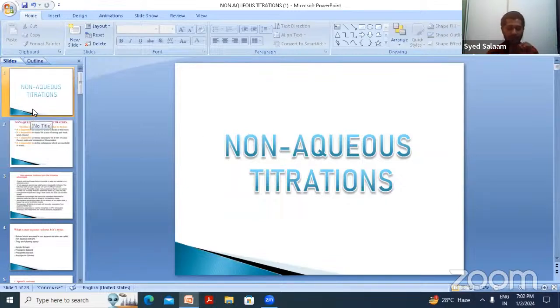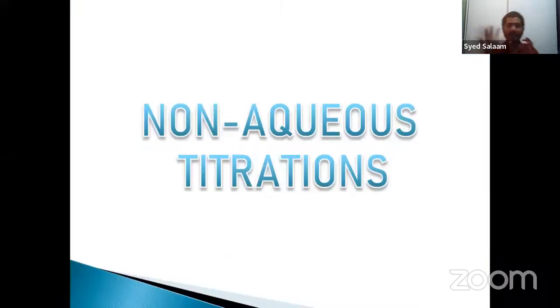Now I'll go through all of this again as a briefing on what non-aqueous titrations are. By the name itself, non-aqueous titrations are titrations that employ solvents other than water.